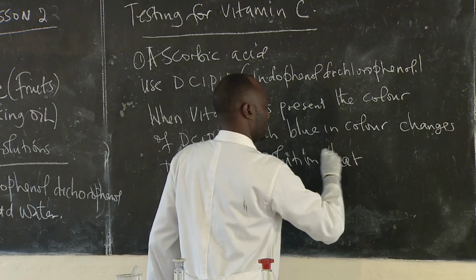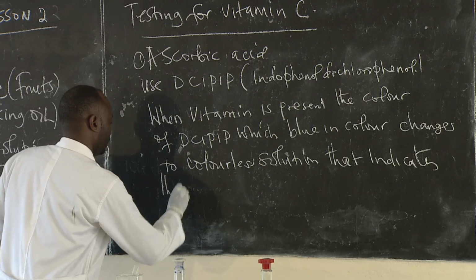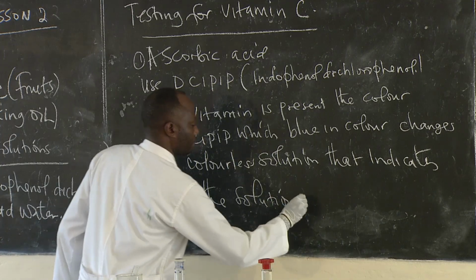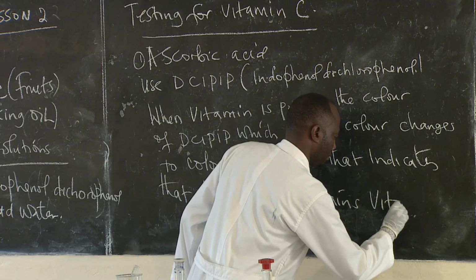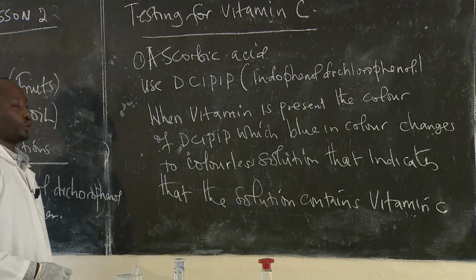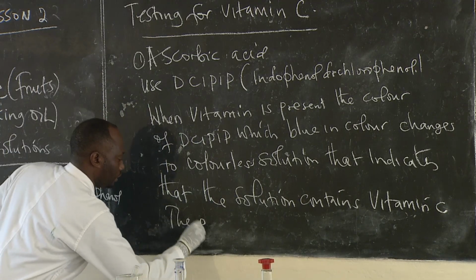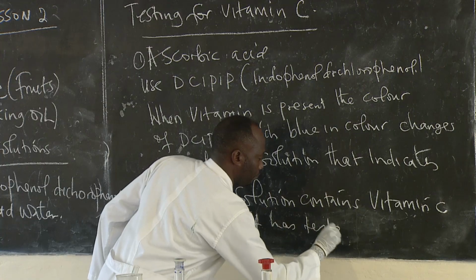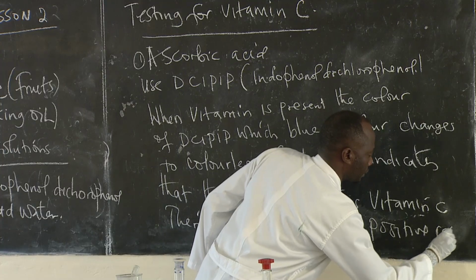That indicates that the solution contains vitamin C. So you can say from there, therefore, it has tested a positive result. Positive result.